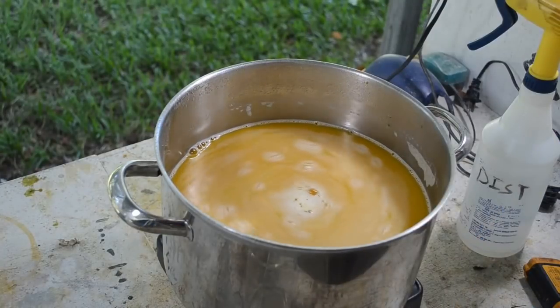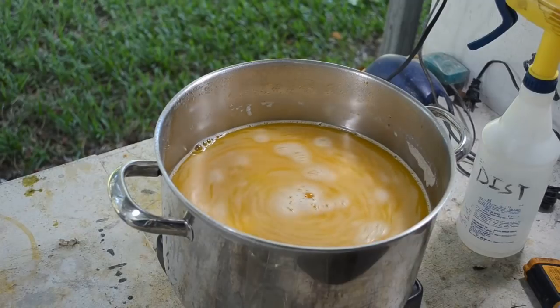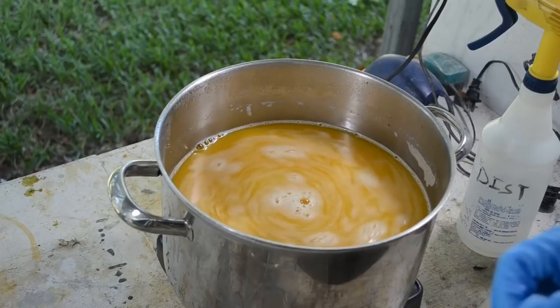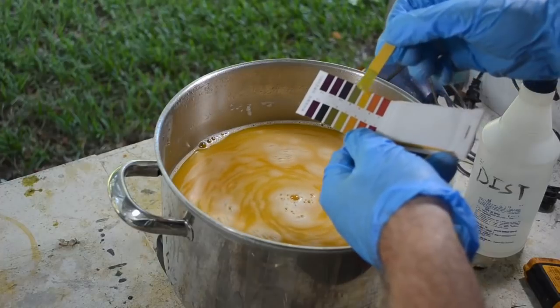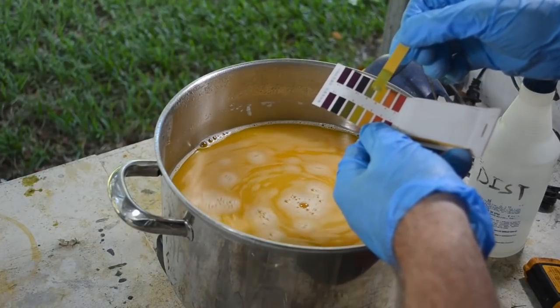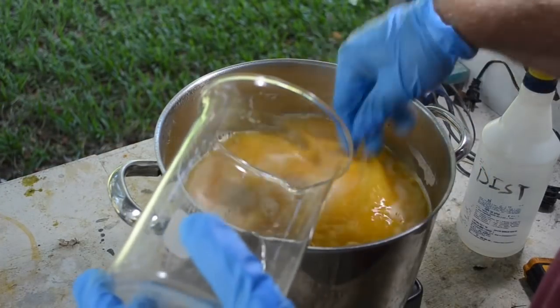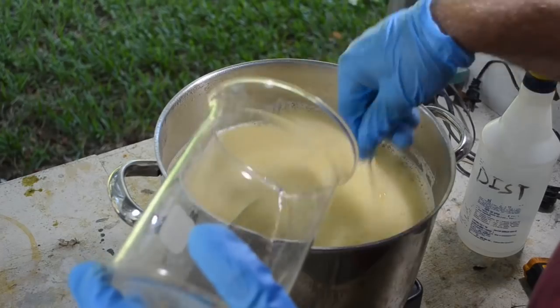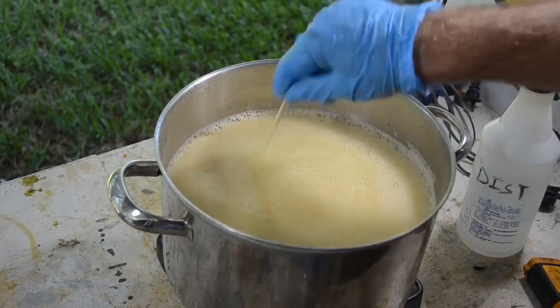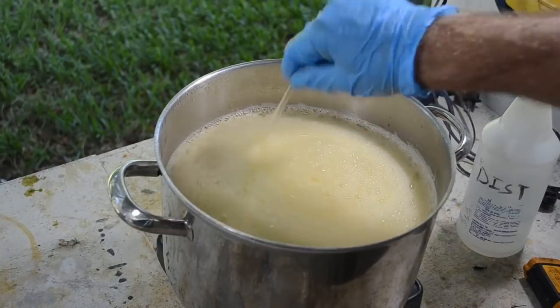Okay, notice how much lighter in color the liquid is too. It was a dark syrupy red before. Now it's a sort of light yellow orange. Well, let's see what we got here. Oh yeah. We are right about at 7. We're just about neutral. So now we're headed into acid territory with each addition. It's getting close. Yep, here comes the foam. All right, so it's just a matter of continuing to do this until we get down to our target pH.